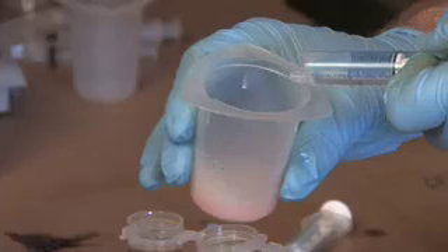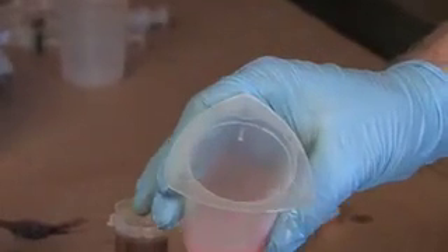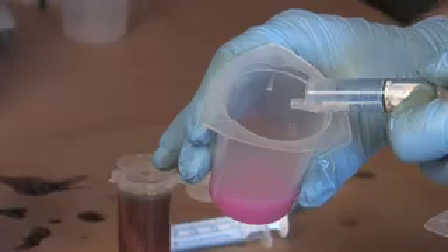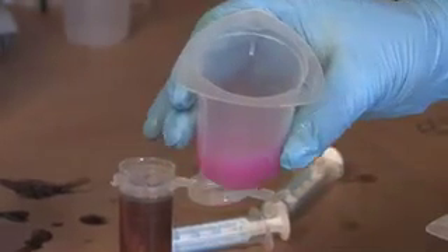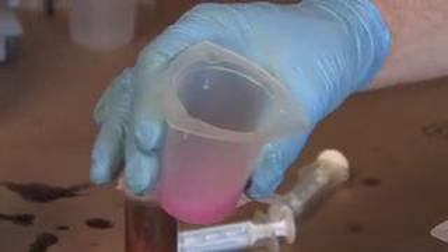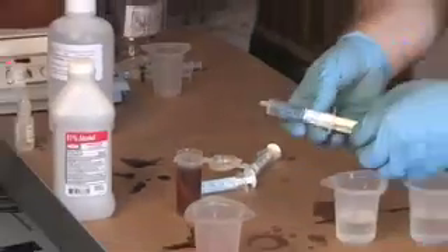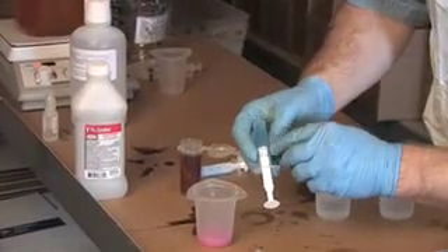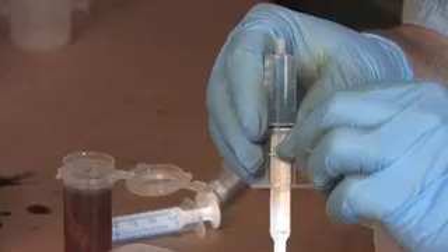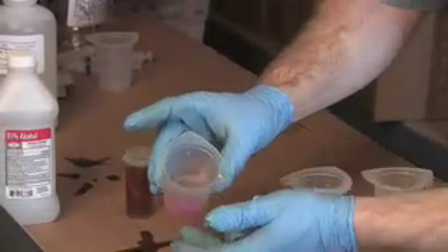You know you're done when the solution turns pink and stays pink for about 30 seconds. There we're starting to come into it — there, we're a nice pink. Just a little bit more to be sure, then we'll let it sit for about 30 seconds. After 30 seconds if it's still that color, write that number down. We started with 10 milliliters and we're now at 7 — so that's 3 milliliters of titration solution used to neutralize the acid in our oil.